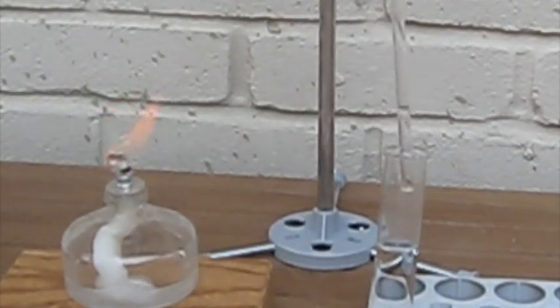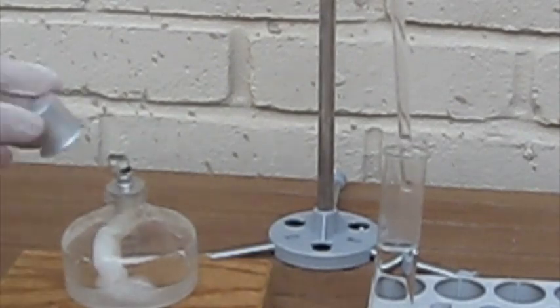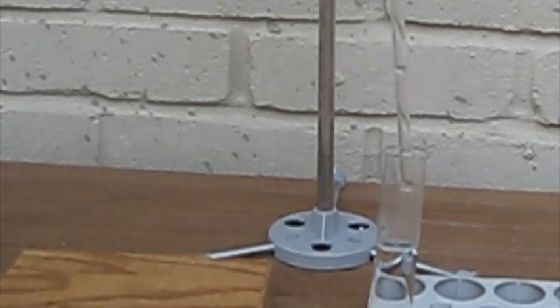You can also see there was a white vapor, which is hydrogen chloride vapors mixed with water, to form hydrochloric acid vapors.